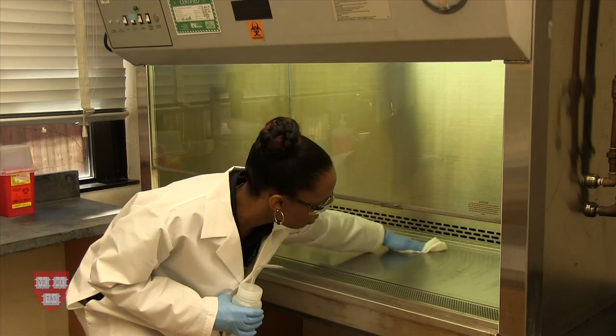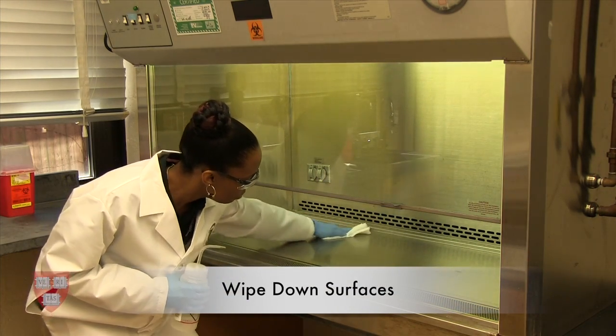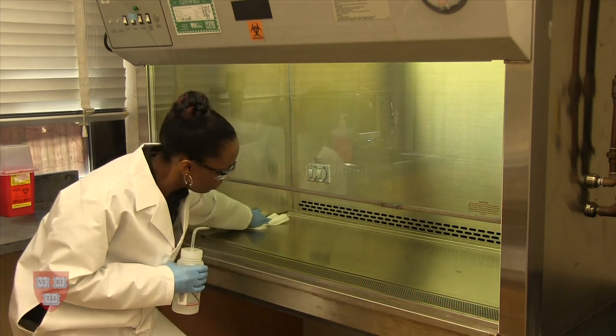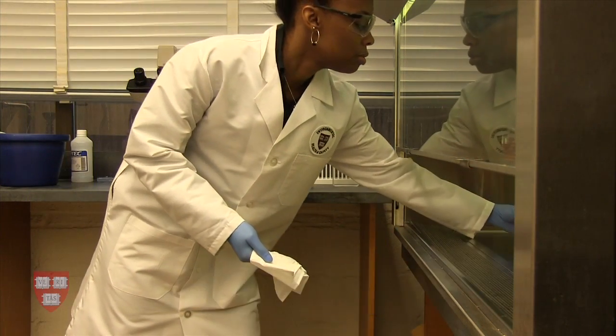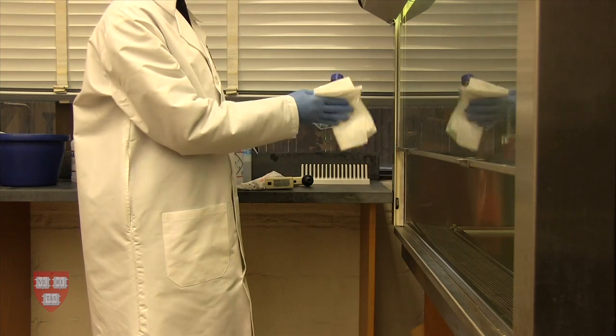After 5 minutes, wipe down the internal surfaces of the BSC with the appropriate disinfectant. In addition, sterile technique requires disinfecting items entering the cabinet. Wipe down bottles and flasks and stock the BSC with sterile equipment. This procedure should be developed based on the sterility needs of the experiment.